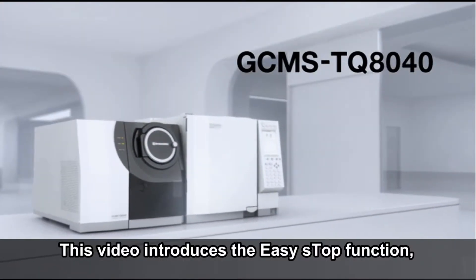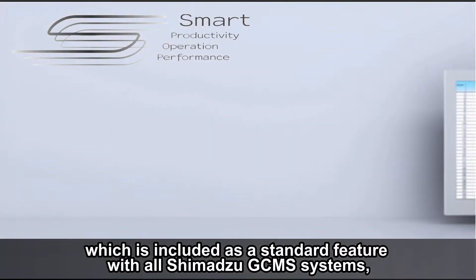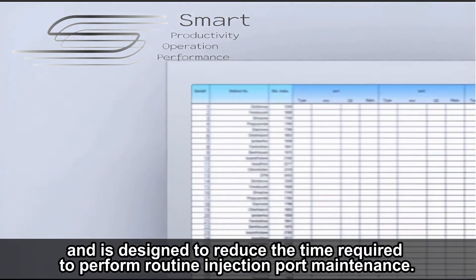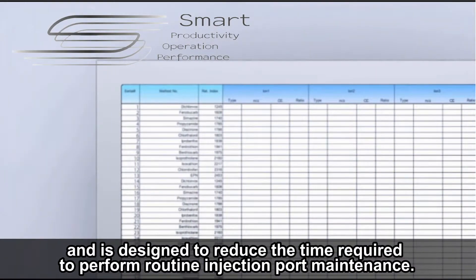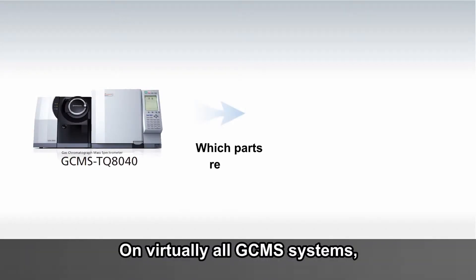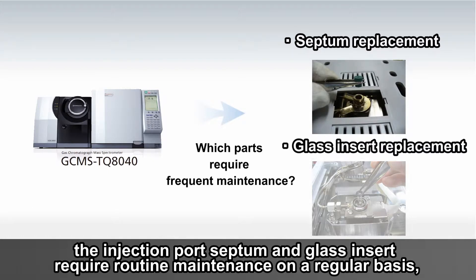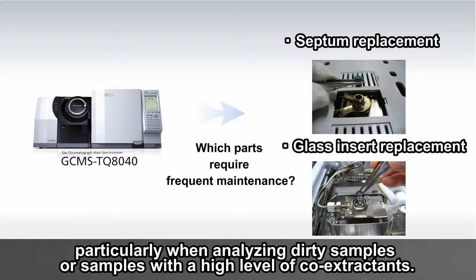This video introduces the EasyStop function, which is included as a standard feature with all Shimazu GC-MS systems and is designed to reduce the time required to perform routine injection port maintenance. On virtually all GC-MS systems, the injection port septum and glass inserts require routine maintenance on a regular basis, particularly when analyzing dirty samples or samples with a high level of co-extractants.